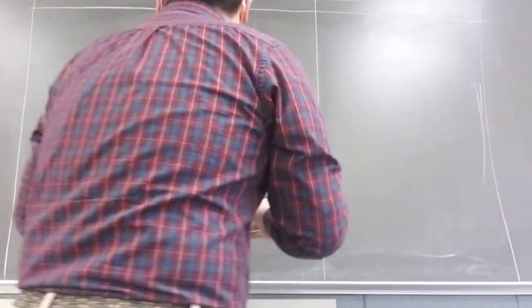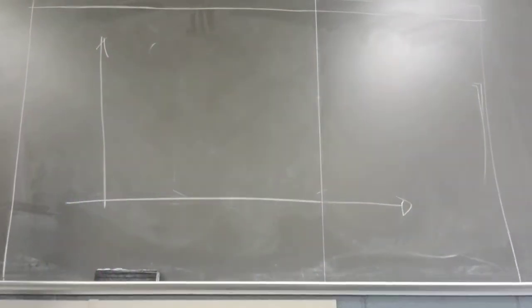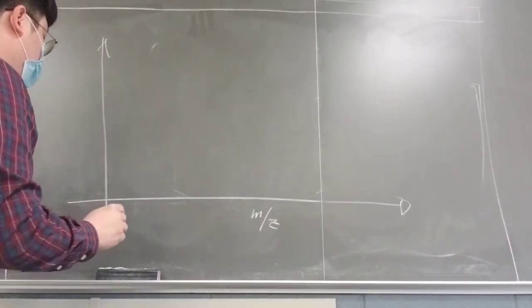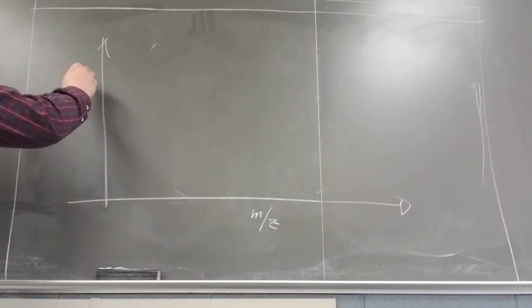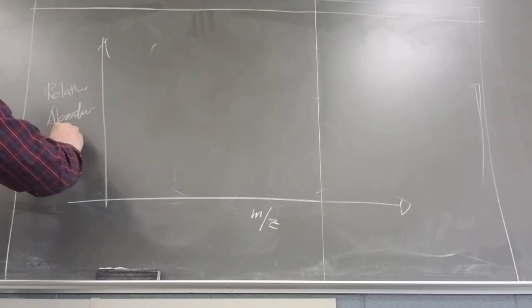Okay. So whenever you have some type of mass spec bar graph over here, once again, the x-axis is the mass to charge ratio, which is simply the same as the molecular weight of the fragments. And this is once again relative abundance in percentile units.